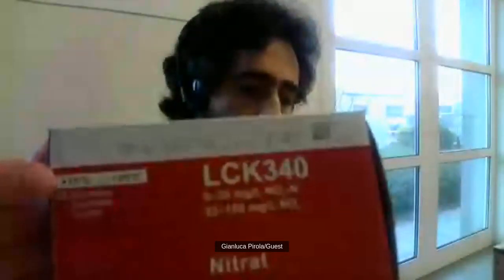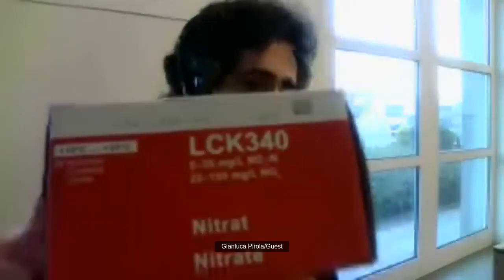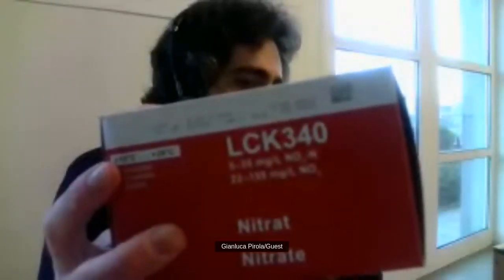No, only ammonia. You can see on the cuvette test method, also on the box. Just let me check. For example, here you can see this is ammonia, while this is nitrate: temperature 15 to 25, room temperature. So when you receive the cuvette, look here to see where you have to store your cuvette.